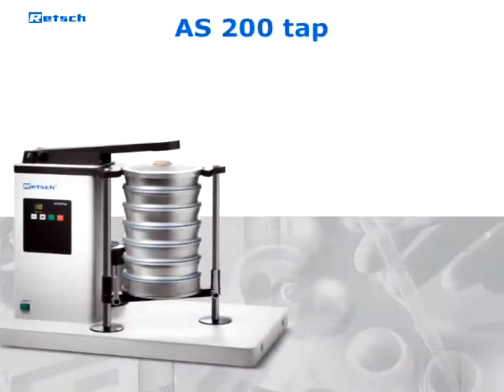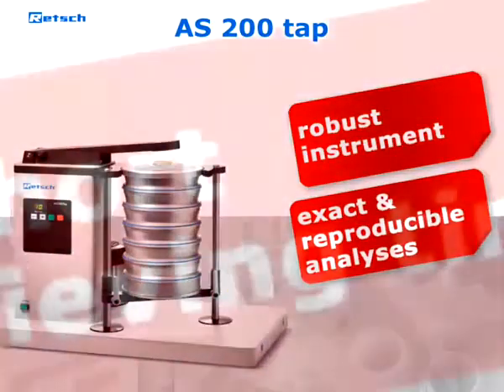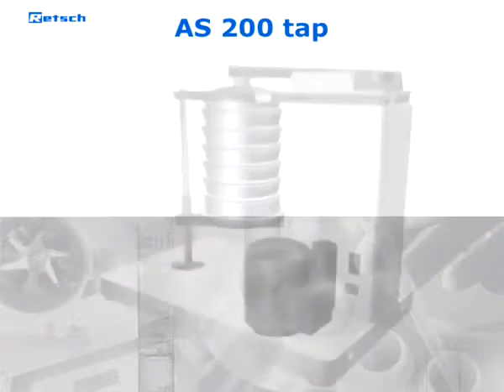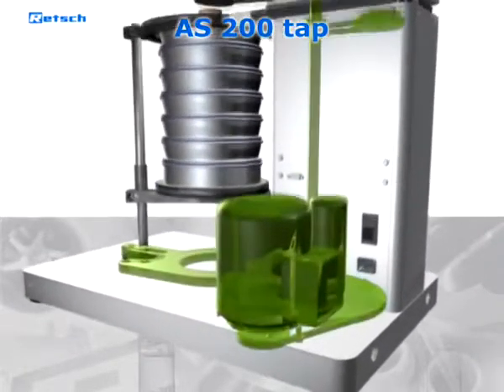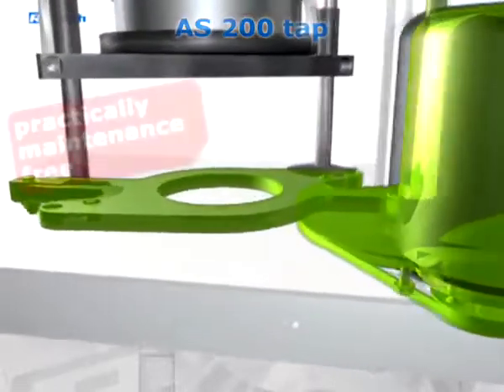The AS200 TAP is a robust instrument for exact and reproducible sieve analyses in a very short time. Unlike those of other tap sieve shakers, the robust and powerful drive designed and manufactured by Retsch is almost maintenance-free.